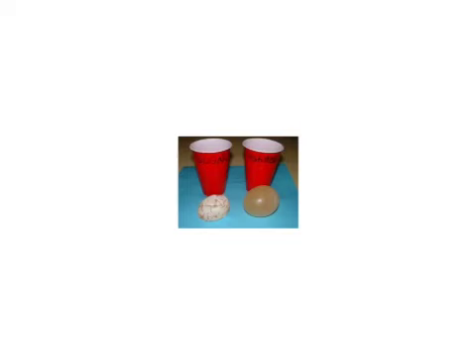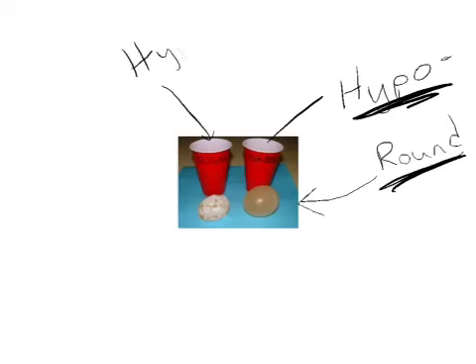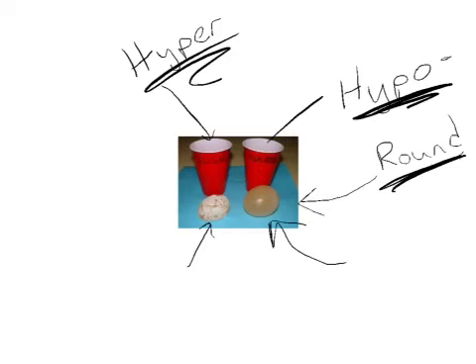I thought I'd give you one more look at this distilled versus sugar water, because I thought this picture actually had a better picture of the distilled water, because notice how round the egg is, very round. Remember, distilled water means that there's no solutes in the water, so this is the hypo, right? And that means that there's not a lot of solutes in the water, where this is the hyper, where you have a lot of concentration of sugar outside, not a lot inside. So here you see the egg shriveling up, and here you see the egg almost perfectly round, swelling up to an extreme amount.